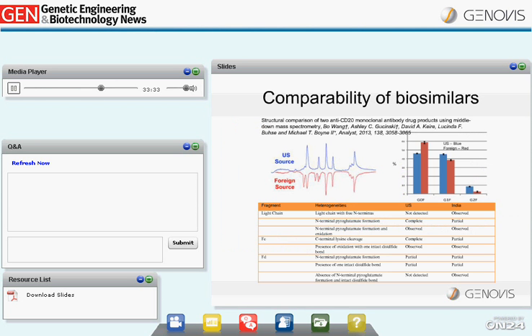In a recent paper by Michael Boyne and co-workers at CDER, FDA, a U.S.-approved monoclonal antibody was compared to a biosimilar version from India using the middle-down approach with FabRICATOR digestion and subsequent reduction. As shown on the right, they could clearly and rapidly identify significant differences in the intensities of the observed glycan forms between the U.S.-approved rituximab and the biosimilar version.